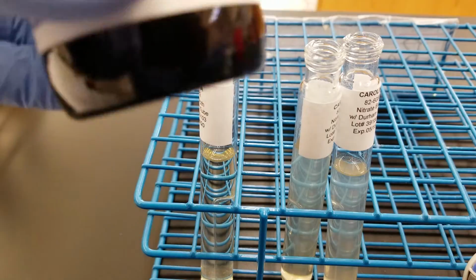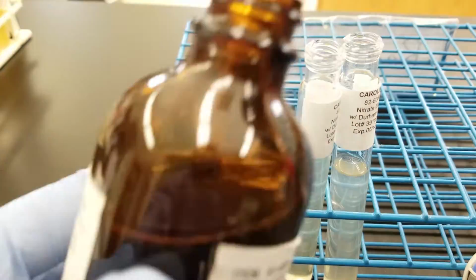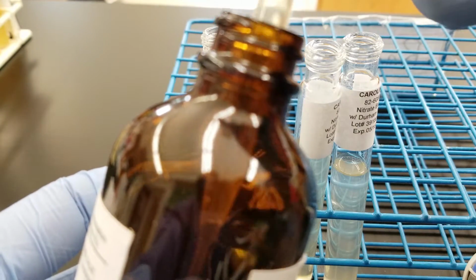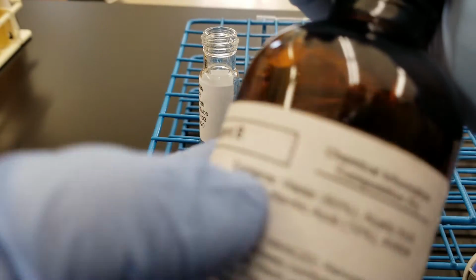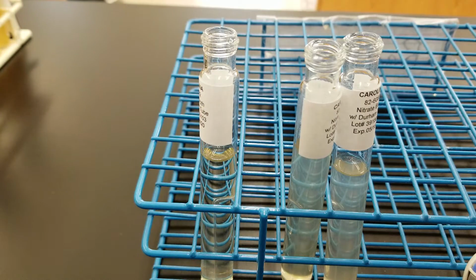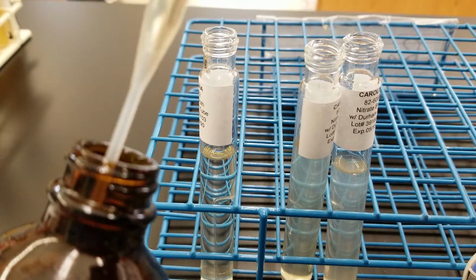So you're going to end up swirling it, uncapping it, same thing, 5 drops. Going to pull out a bit. So this one looks different. It's like a normal broth color, whereas the other one was like a reddish brown. 1, 2, 3, 4, 5. 1, 2, 3, 4, 5. 2, 3, 4, 5. All right. Put the rest back in.